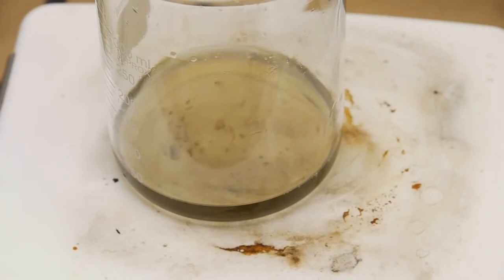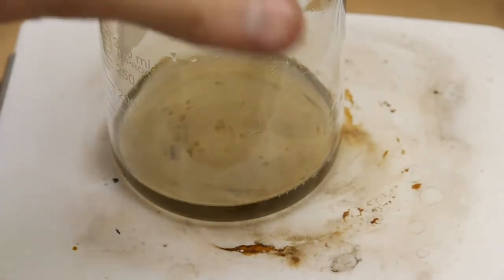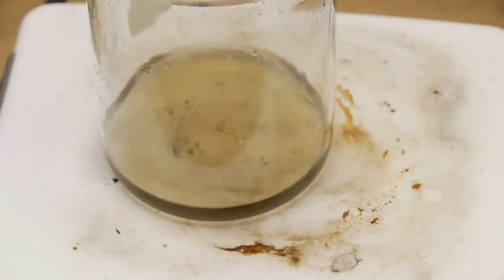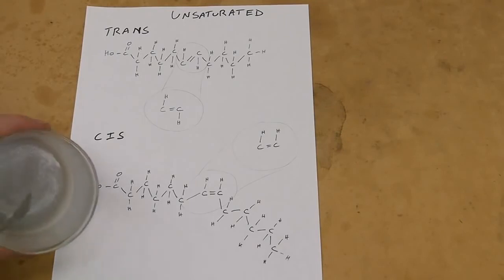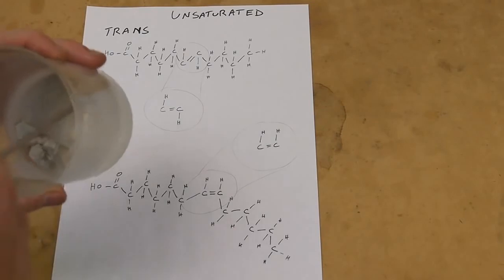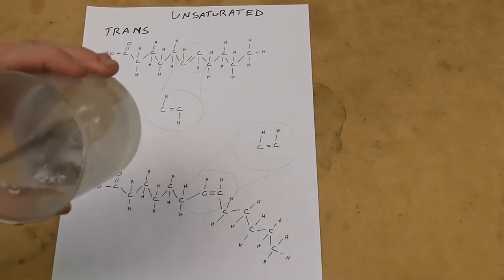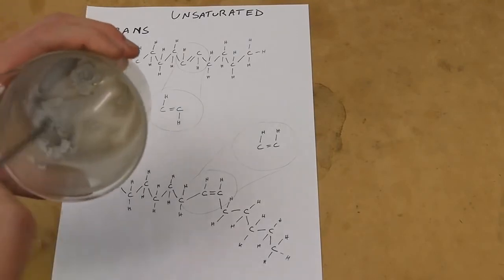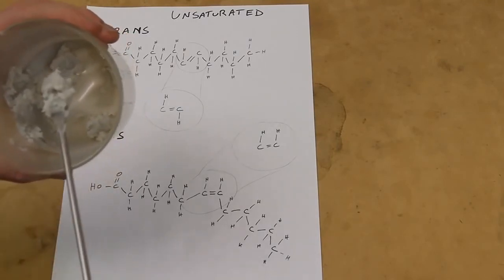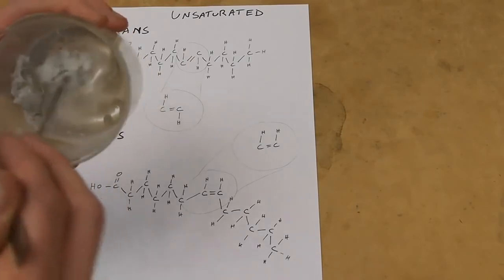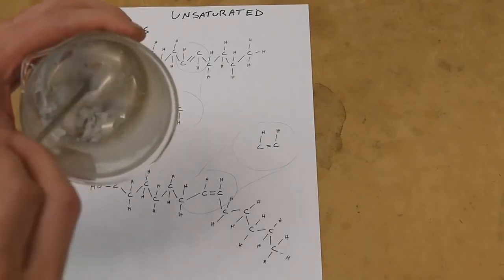What we're left with is the hydrogenated or partially hydrogenated olive oil. Of course it's liquid now because the temperature is quite high—150 degrees C—so we'll let this cool down to room temperature. Here's our finished product. It's basically a spreadable sort of olive oil—quite thick and heavy, about the consistency of butter at room temperature. It smells quite a bit like olive oil. The color is actually from the remaining catalyst carbon that I couldn't filter out; otherwise it would be whitish or even slightly yellow from the original olive oil color.